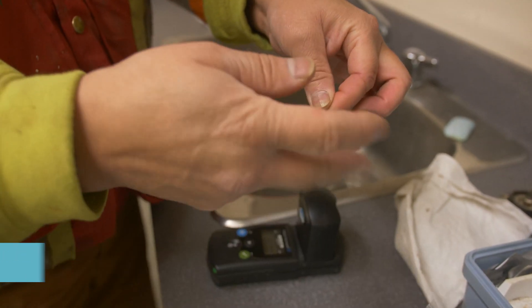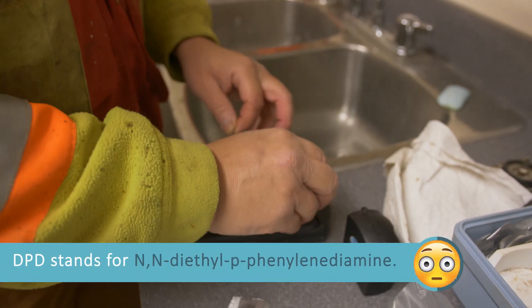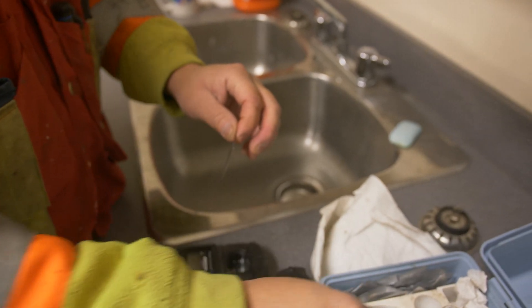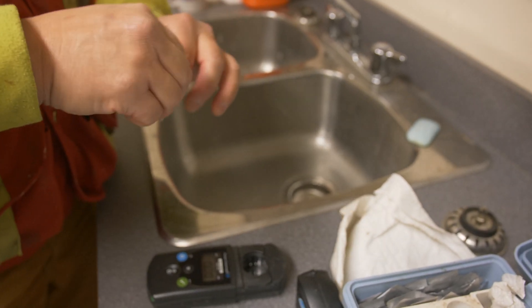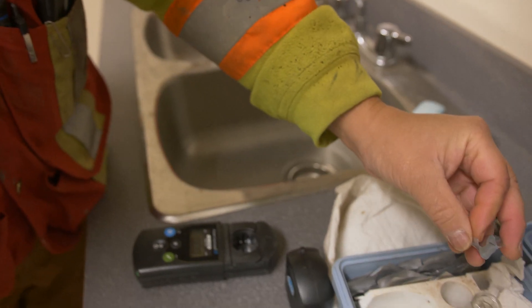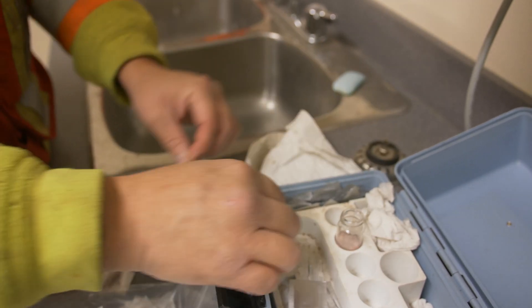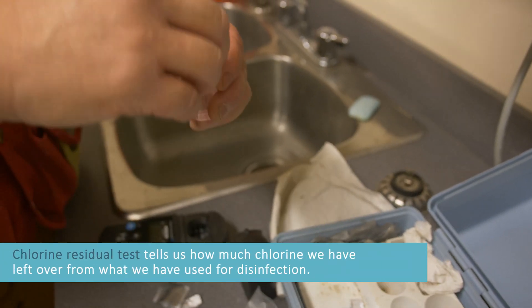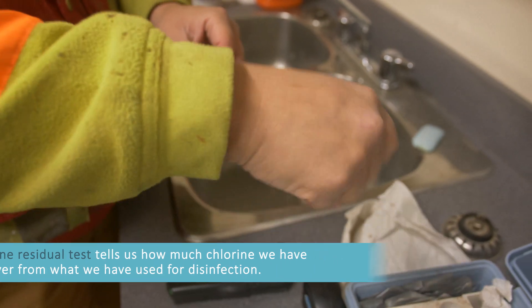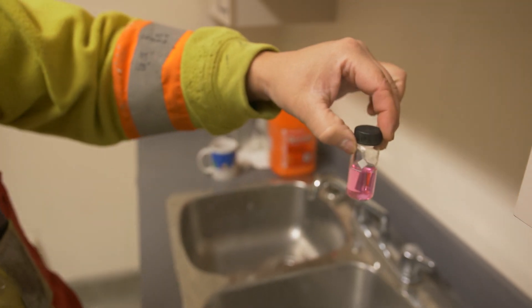Take the packet — the DPD free chlorine. What we're looking for, like I said earlier, is a pink color. This is telling us how much chlorine we have left over from what we've used for disinfection. Give it a shake. There you see it's fairly dark.